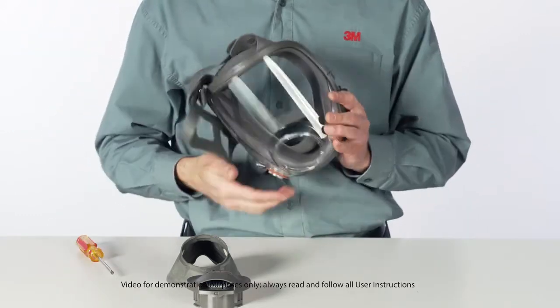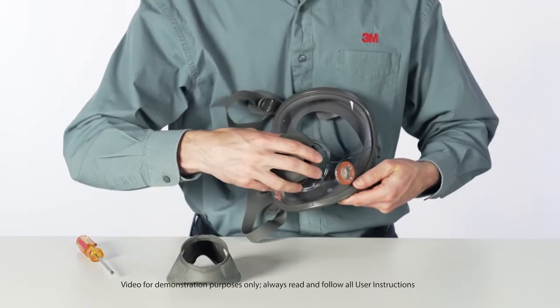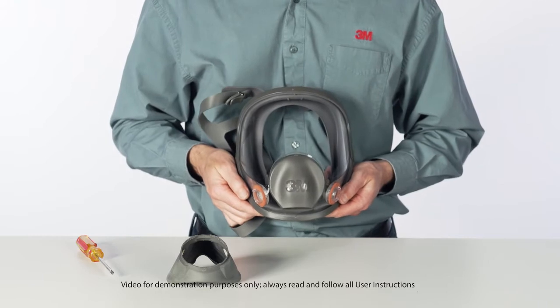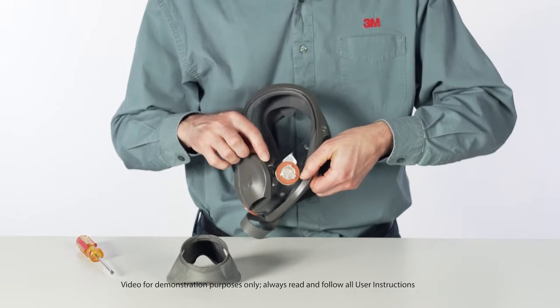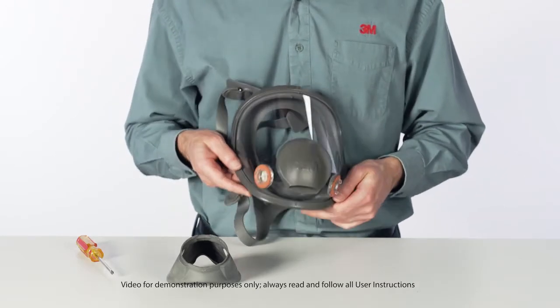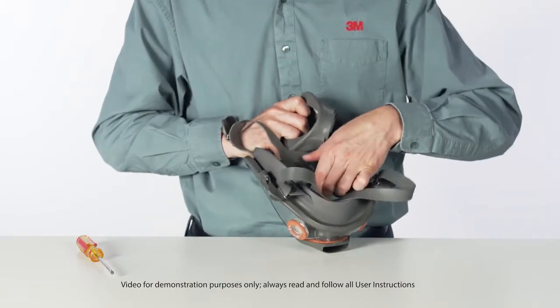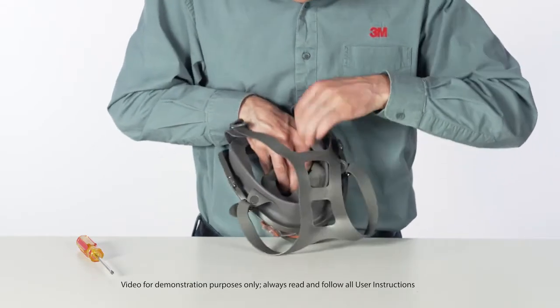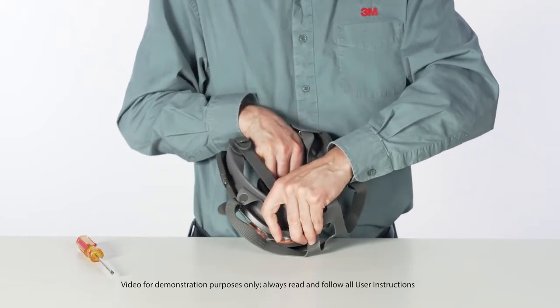Install the center adapter assembly. Align the tabs on the center adapter base with the notches in the center port of the facepiece lens. Slide the adapter into the lens port and twist it clockwise one-quarter turn to stop. Be certain that the center adapter gasket is properly in place and sealed and that the adapter assembly is fully engaged. Replace the nose cup assembly by positioning it onto the center adapter aligning arrows. Make sure the nose cup is firmly seated under the center and side tabs.